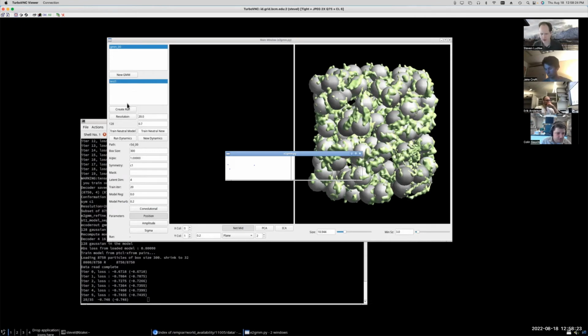Okay, yeah, so that's actually fine. When you create the run and you type a name and hit enter, it will pop out a bunch of error messages on the screen. I needed to go back and disable those. Those are printed just so I can keep track of what's going on while I'm debugging things.